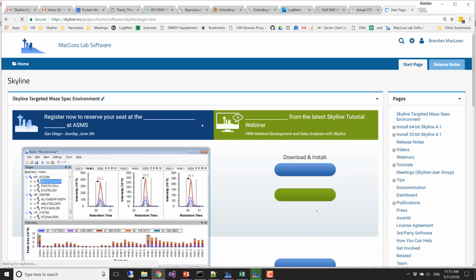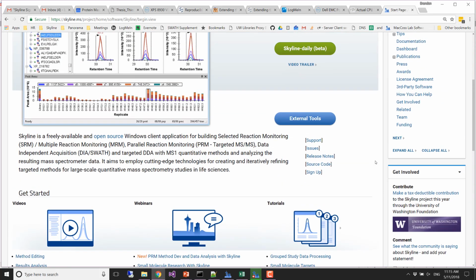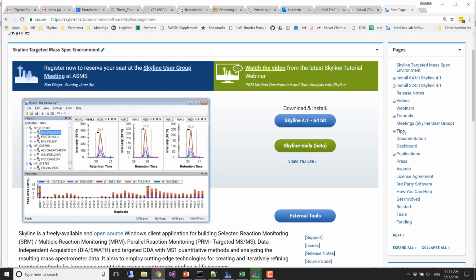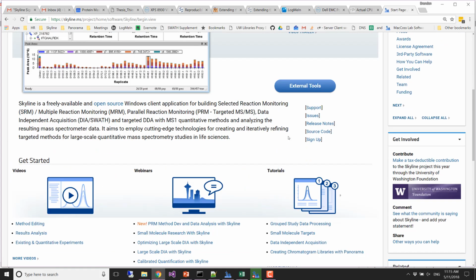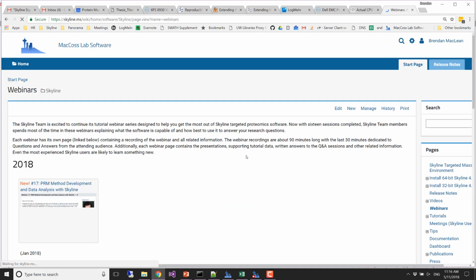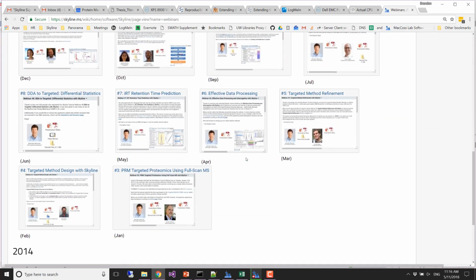If I click on this Skyline installation page, which you all should have visited, there's a table of contents over here, and if I go to the webinars page, or I can get to it down here, more webinars, I think. Is that going to take me to the right place? Yeah, if I click more webinars, now I've got a list of all the webinars that have been done.